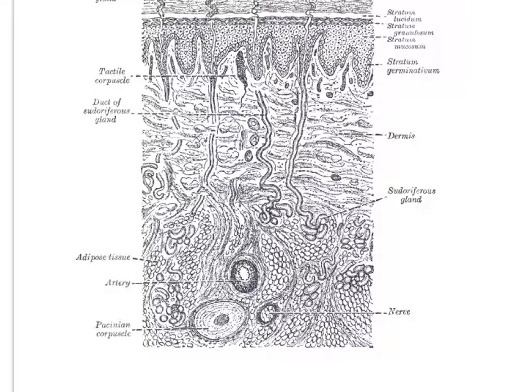And then I also want you to notice these glands. What they're showing here is mostly these sudoriferous glands, and you're going to see one of those in this layer. Remember that sudoriferous is your sweat gland. Think odor, sudor, odor. The sebaceous glands, those are your oil glands, and remember those are typically attached to a hair follicle, which you do not have on the palms of your hands and the soles of your feet. So you're not going to see oil glands, sebaceous glands. You're also not going to see hair follicles in this slide. But there is one sweat gland, a sudoriferous gland, that we'll look at.